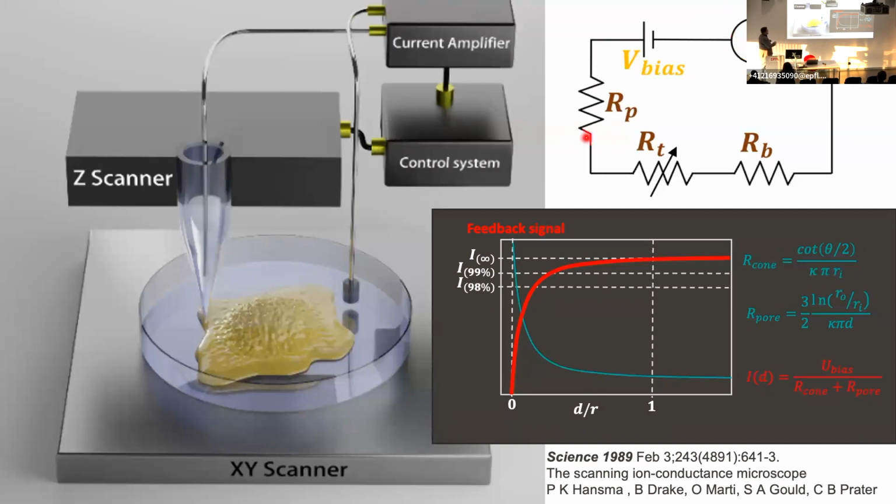Now, the current is determined by whatever resistance we have here coming from the electrode out through the path. Then the resistance as the ions come from here to here. But it also depends on the resistance that the ions physically feel as they're coming out of the tip past the sample. So you can think of it like this. Normally I bring a tube, and I forgot, I'm sorry, I have to just do it like this. Let's assume this is my pipette. It actually has a little hole at the end.